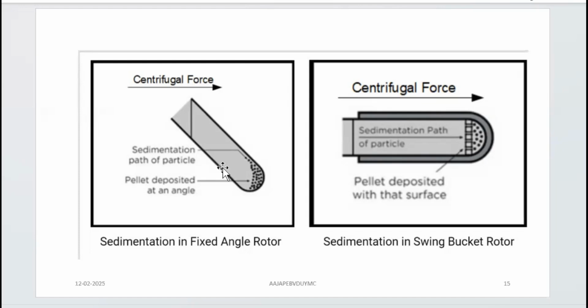So when the particles are running from the uniformly distributed condition to the next step, that is, they are getting arranged on the outer wall and they start settling. If you remember this sequence, then a strong convective flow is going to get produced during separation, which is going to be an unwanted, undesirable effect, right? Because it is working oppositely. So it is going to interfere with sedimentation.